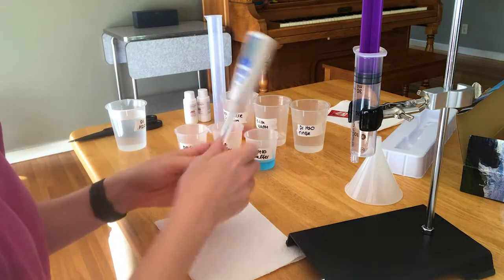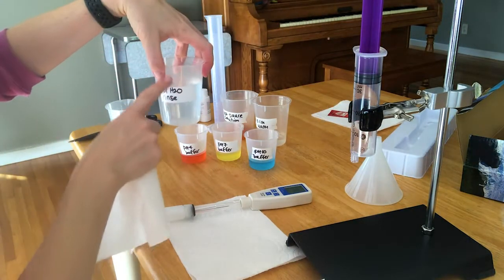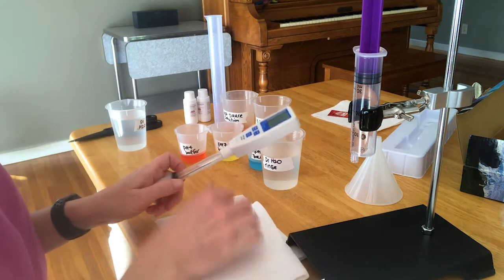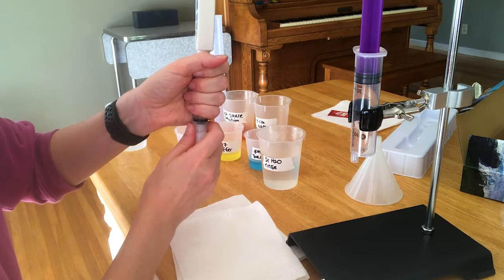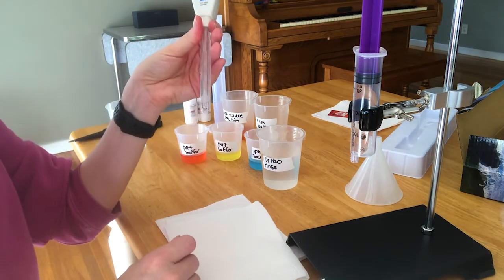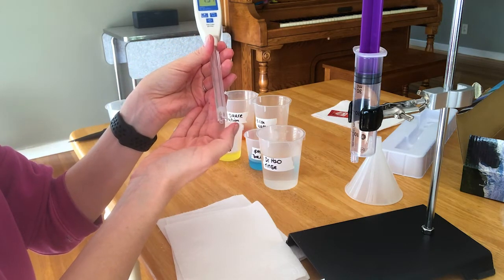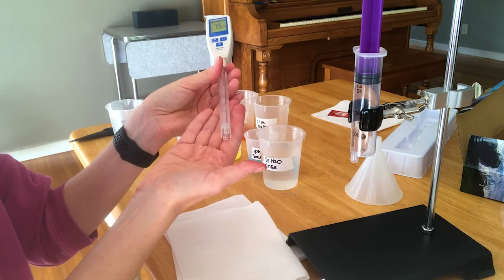We want to be able to rinse this pH meter off with distilled water after every single solution, but we don't have a wash bottle so I'm improvising — I put some DI water into this beaker. This isn't ideal because you don't want to contaminate the pH meter, but it's the best I could do. Since this glass electrode is sensitive to ions, you do want to use distilled water and not tap water. There's a glass bulb on the bottom that's very sensitive and fragile, so you don't want to touch it or scrub it with a paper towel.